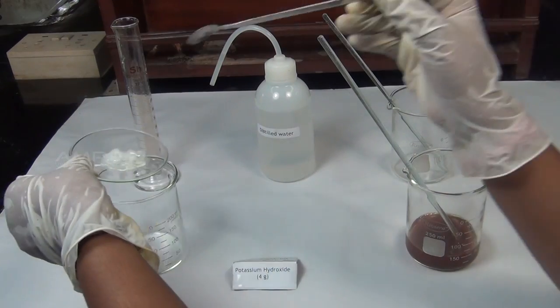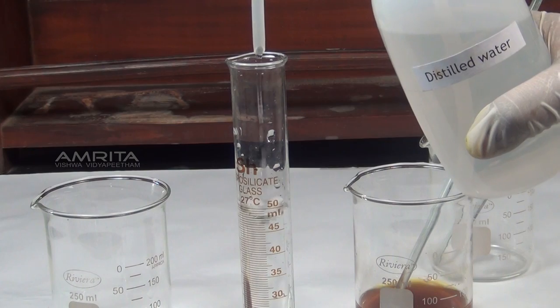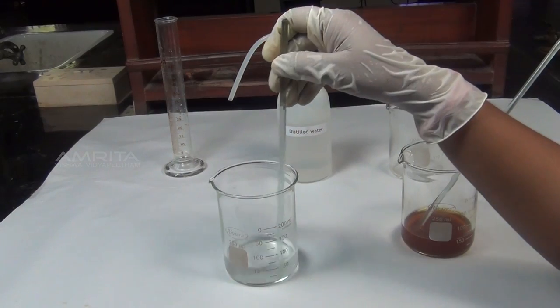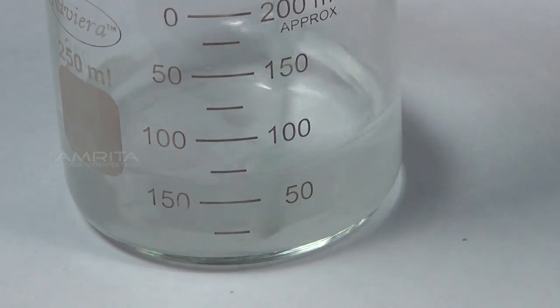In another beaker, take 4 g potassium hydroxide. Pour another 50 ml distilled water into this beaker. Stir the solution using a glass rod to dissolve potassium hydroxide.